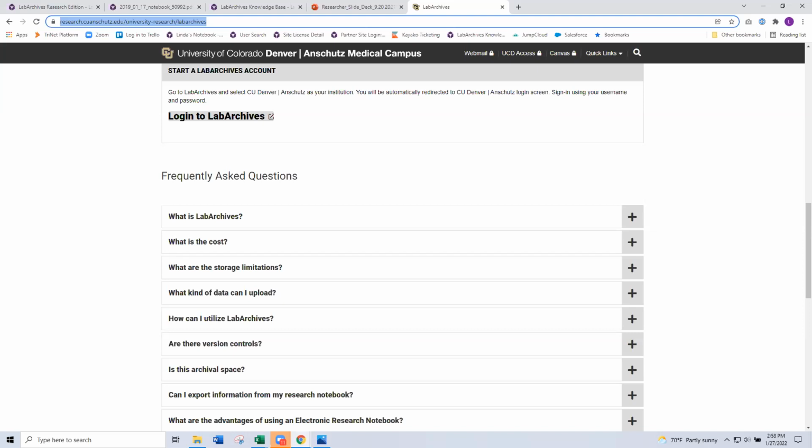So how about, Nicholas, a zip file? Somebody else we're working with recently sent us a lot of different Word documents for processing to put into LabArchives. They sent it as a zip file, and I uploaded that zip file into LabArchives and did it that way. Perhaps you could look at trying that.